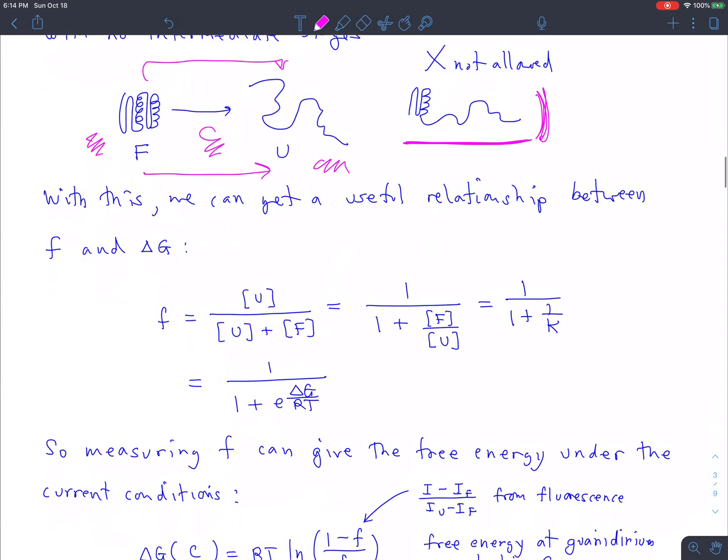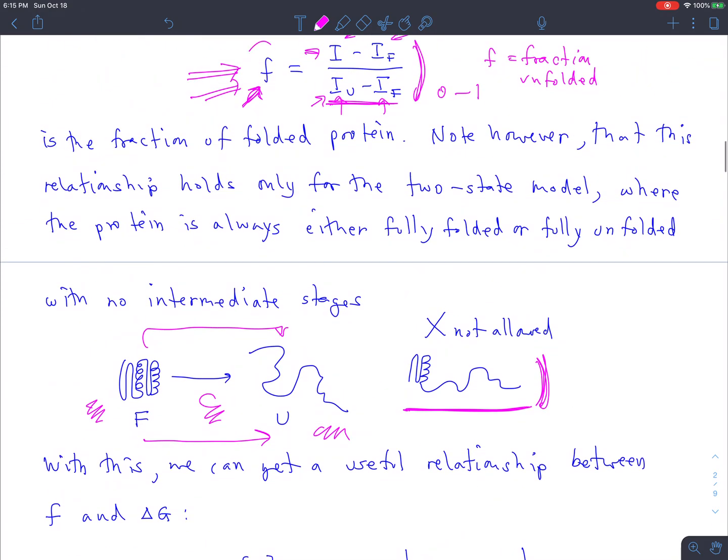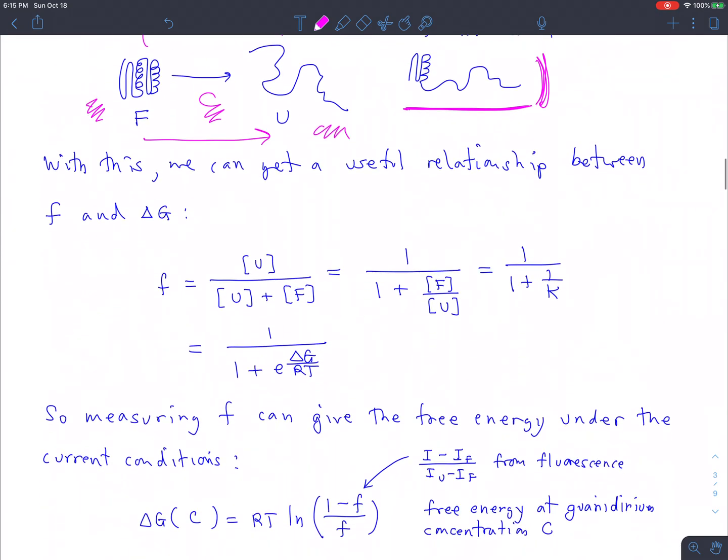All right, so how does this work? How does this F give us what we want? Well, the fraction unfolded is the following, right? It's the concentration that's unfolded over the total concentration of the whole protein, that is the unfolded plus the folded stuff. That's obviously the fraction that's unfolded. If I divide top and bottom by the concentration of unfolded stuff, then this fraction is 1 over 1 plus the ratio of folded to unfolded.